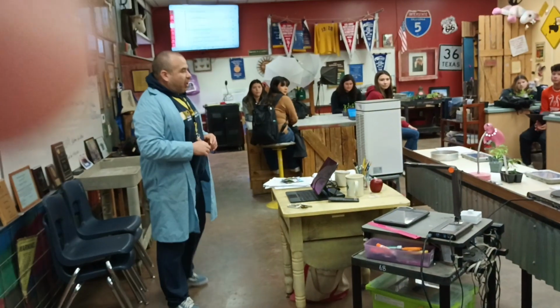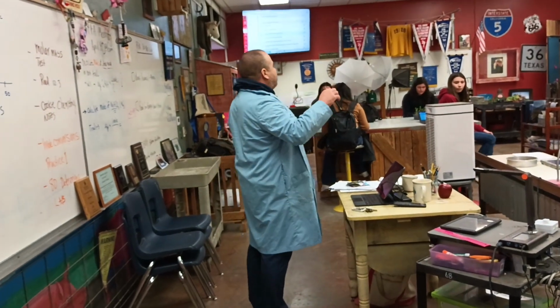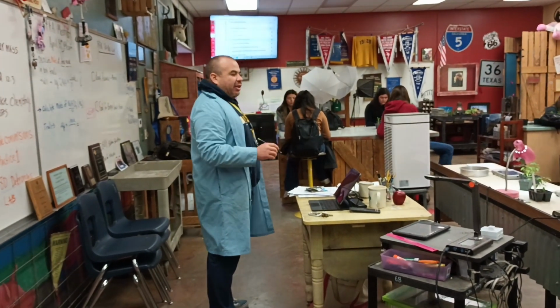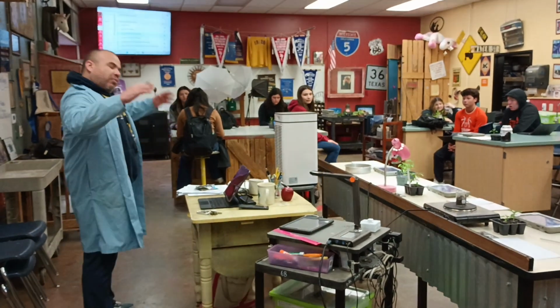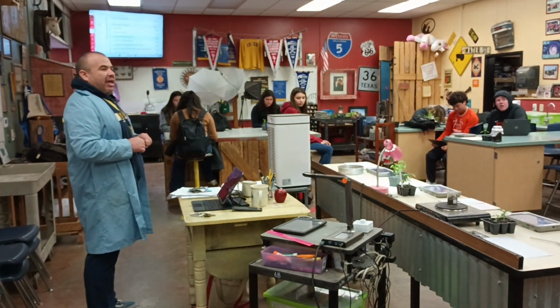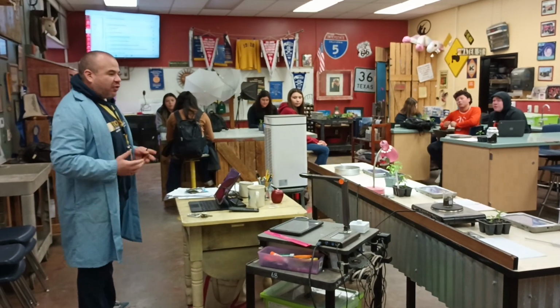Okay? So we're going to be doing some soil temperature testing on these particular plants. Be careful on the roots. You guys have done this many times. Just be careful. We are going to be taking notes on the data that we collect, and we're going to share that data with one particular student in the class. We're all going to have different data. Respect each other's data. We're here as a group, working together, and the research that we're conducting individually has to be respected. We're all inclusive in the class.